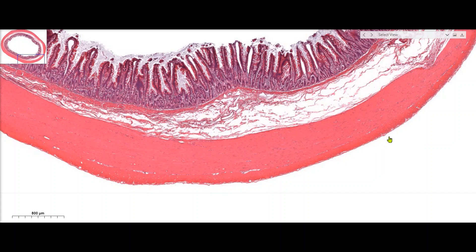The outermost layer, which isn't shown on this particular specimen, would be the serosa. The serosa is essentially a layer of epithelium that overlies a layer of loose connective tissue, and we find the serosa on gastrointestinal tract organs located down in the abdomen.